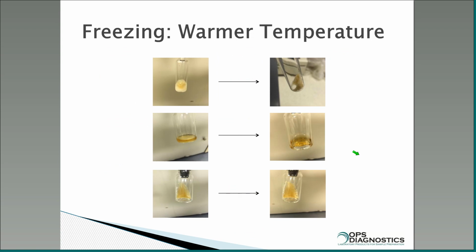All right, so if you freeze using a warmer temperature, and I mean not warm, but minus 20 to minus 40, what's the result? Here's the sample I had before that I showed you in the ampule. This was placed on the freeze dryer, and after a couple of hours, from a better angle, this thing is completely dried. This is about 250 microliters of sample after about 2 hours, and the sample is dry. All I'd have to do is seal it at this point and take it off.